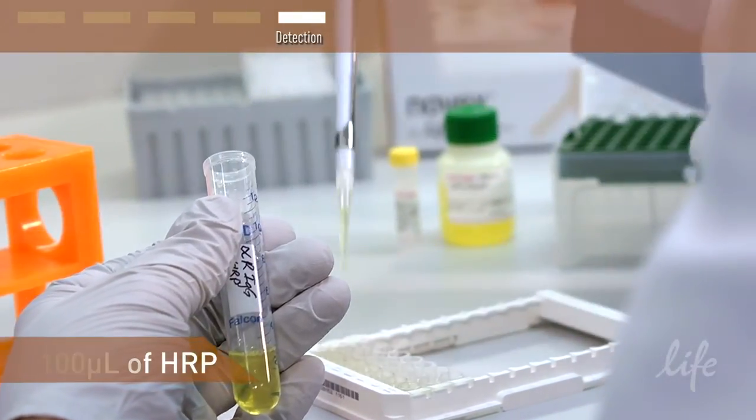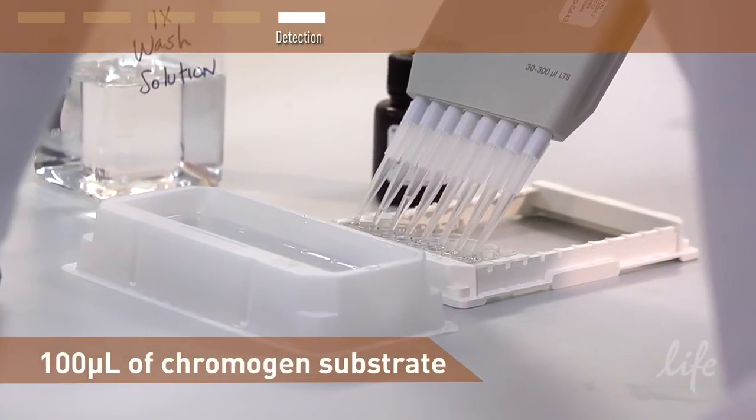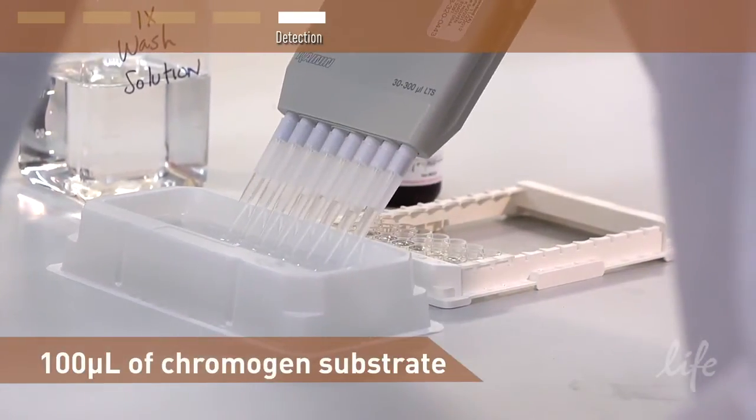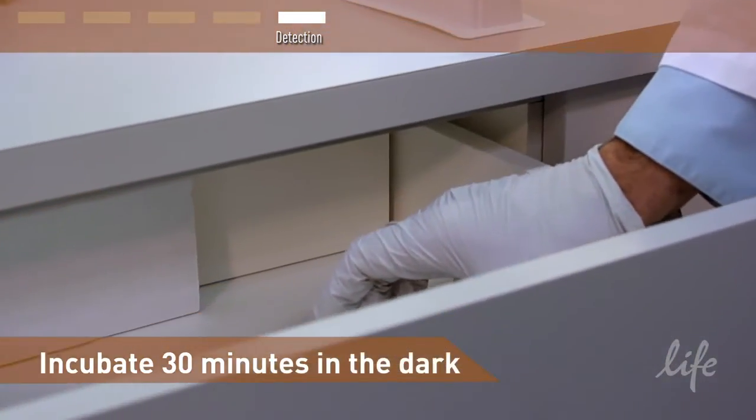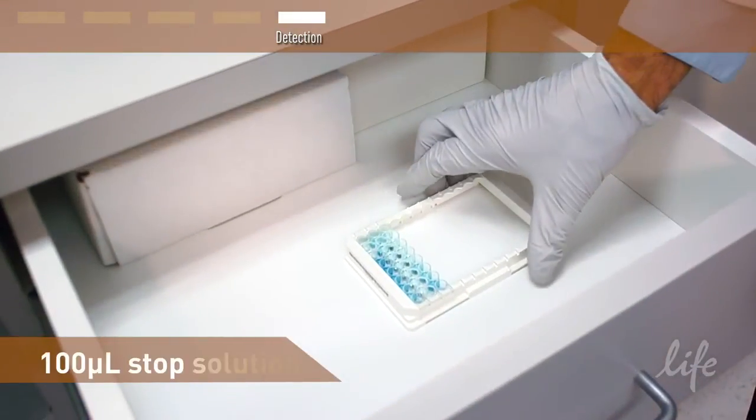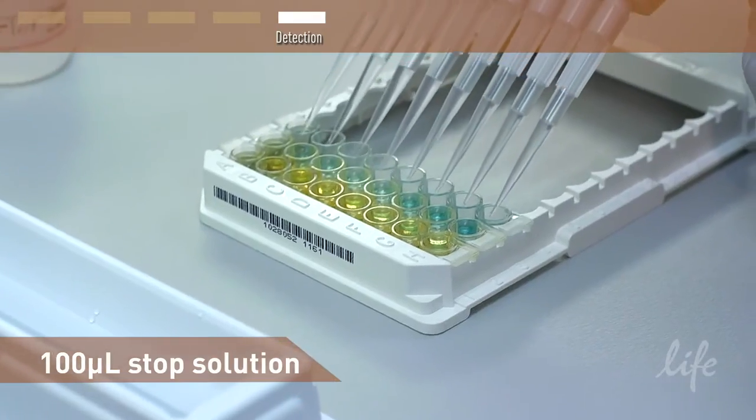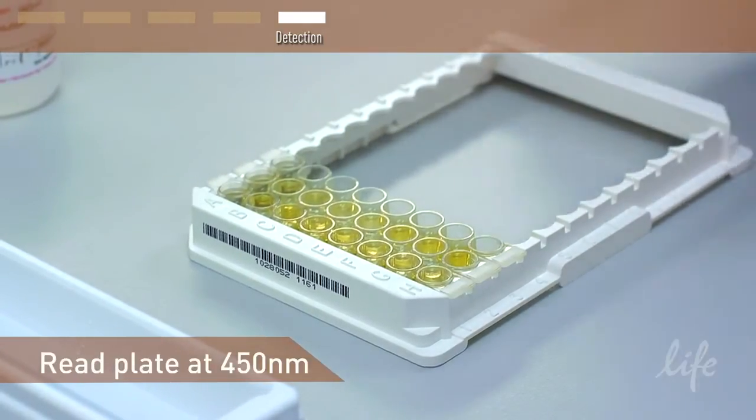After 30 minutes of HRP incubation, wash away excess HRP and add 100 microliters of the chromogen substrate to each well containing sample or standard. Incubate the plate for 30 minutes at room temperature in the dark. Use 100 microliters of stop solution to terminate the HRP substrate interaction. Read your plate at 450 nanometers absorbance.